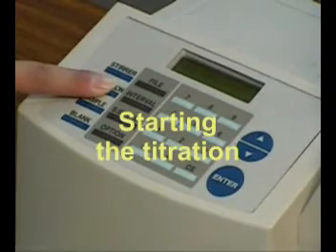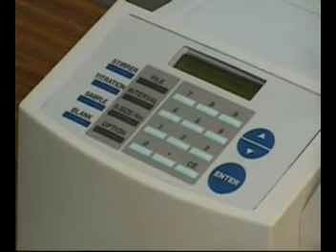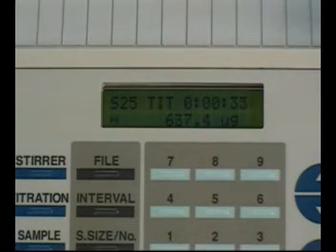Press the titration key to start titration. During the titration, the LCD screen shows the current moisture level. At the first stage of the titration, an H mark blinks on the screen, which indicates that a large amount of water exists in the titration cell.